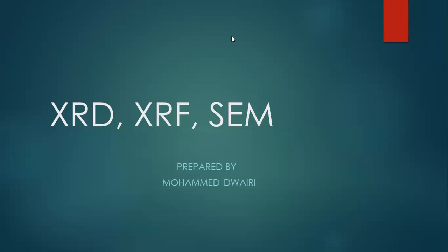Okay, we have finished our small presentation about the XRD, the XRF, and the scanning electron microscope. We will wait for questions from the participants if they want to ask anything about the XRD, XRF, or the scanning electron microscope. Here I have one question: how can I calibrate the XRD and XRF machines?